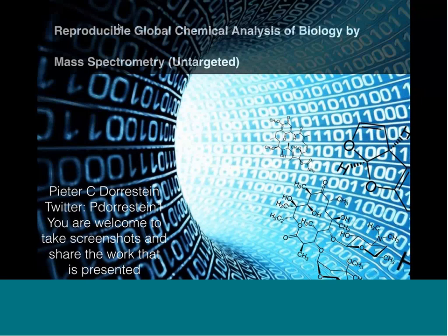And so one of the things that we're beginning to do now is create several thousand data sets where we have a genome sequence as well as metabolomics data sets, so that we can basically have a reference data set that we can search against. So we have an alpha version of a tool like this running, and I'm happy to communicate with anybody on this offline. They can send me an email. But that's exactly where the community is going. And I suspect within the next 2 years, there will be decent tools that allow you to do this in a routine fashion, but it's still a hard scientific problem at this point.